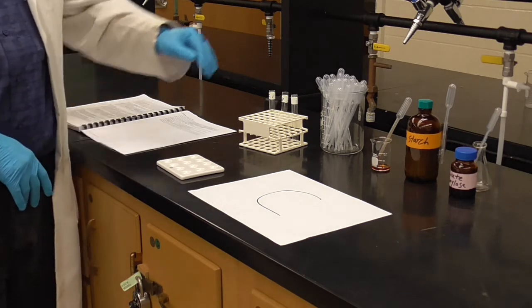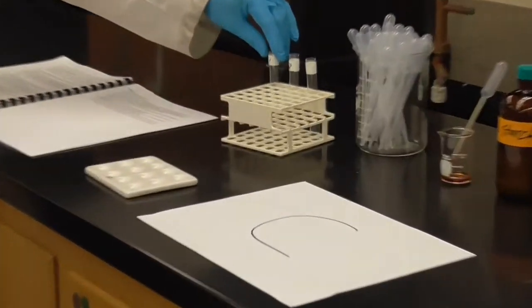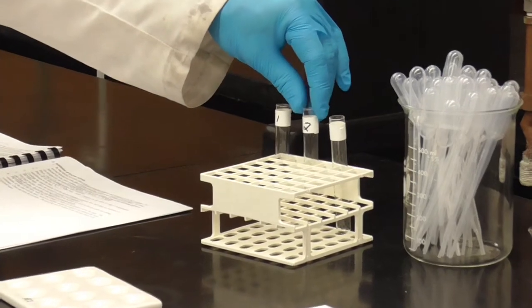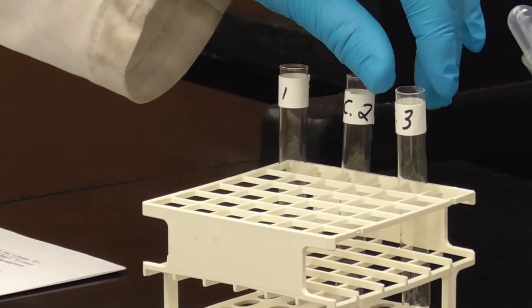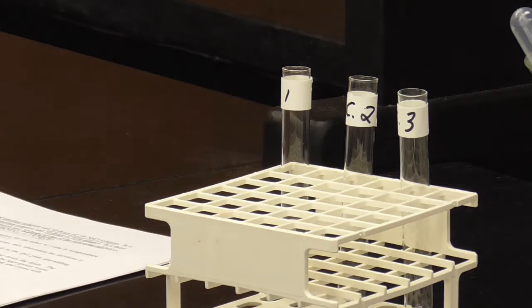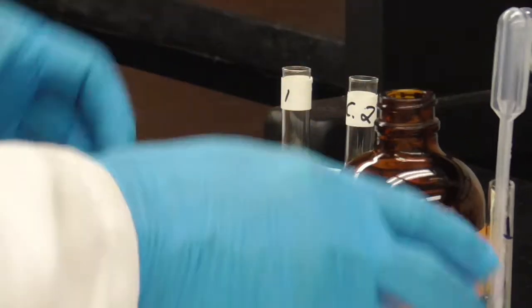So we're going to try this at 3 different temperatures. 37 degrees, that'll be our first temperature. 100 degrees, that'll be our hottest temperature. And then number 3, we'll put in the ice bath, that'll be the cold. Right? And will we see that same effect as far as the activity of the enzyme? Well, that's what we're going to find out. So, in the procedure, step 1, 3 milliliters of our starch solution. So here's our substrate in each one of the test tubes.